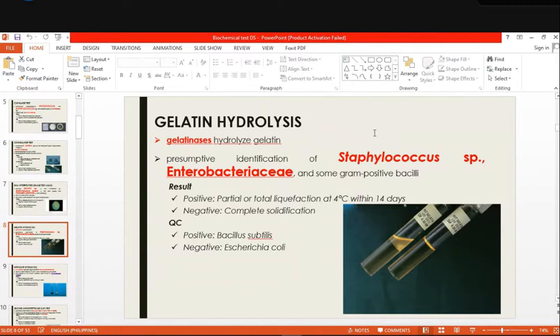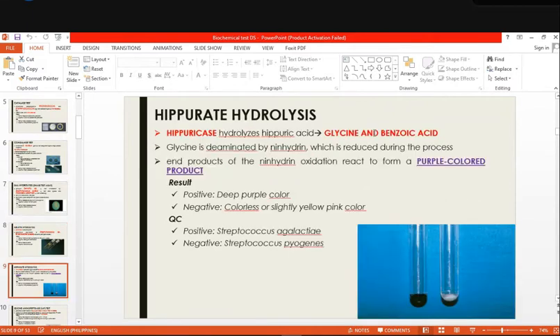Okay. The presence of your deoxyribonuclease enzyme. Indicator natin sa DNA hydrolysis. Methyl green. Toluidine blue. Yes, methyl green? Pwedeng toluidine blue. Okay, very good. Kathleen, Vincent. O, gelatin hydrolysis. Tanggalin ko na.